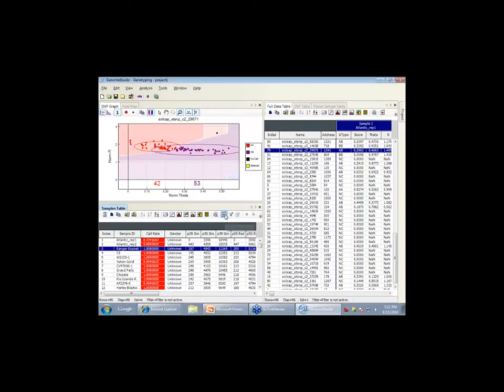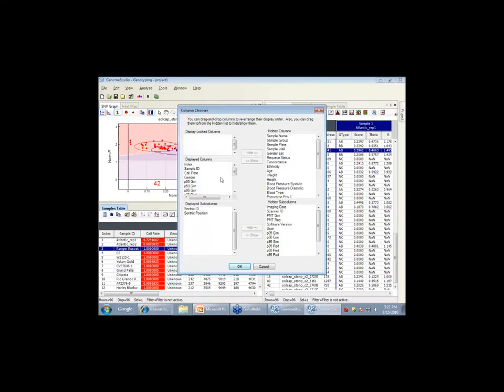And you can do exactly the same thing on the sample data sheet. You can choose what you want. These P's are really percent. So the 5% green, 50% green, these are like medians or percentiles on the green-red scale. To me, they're not that informative on the sample sheet.